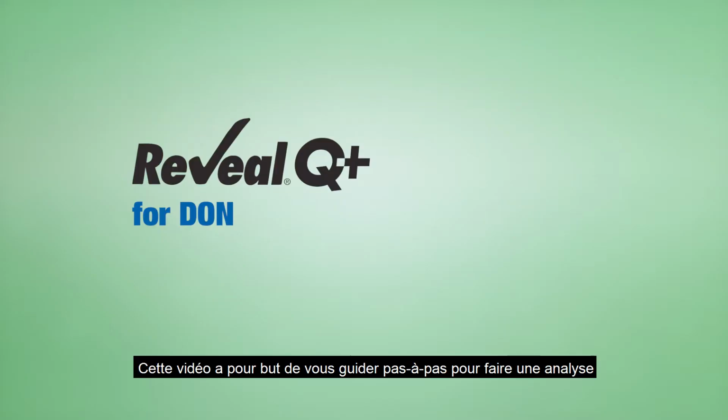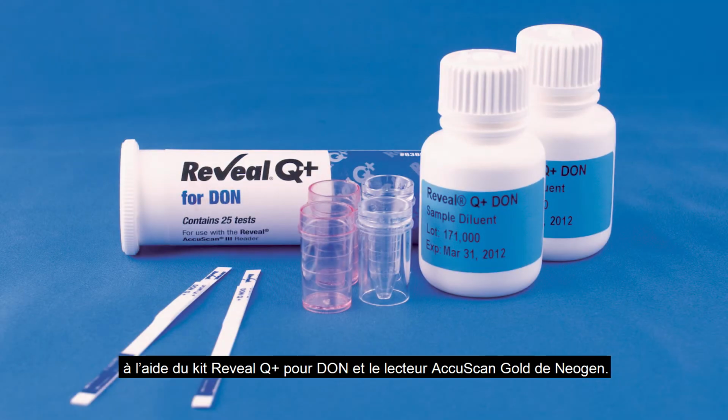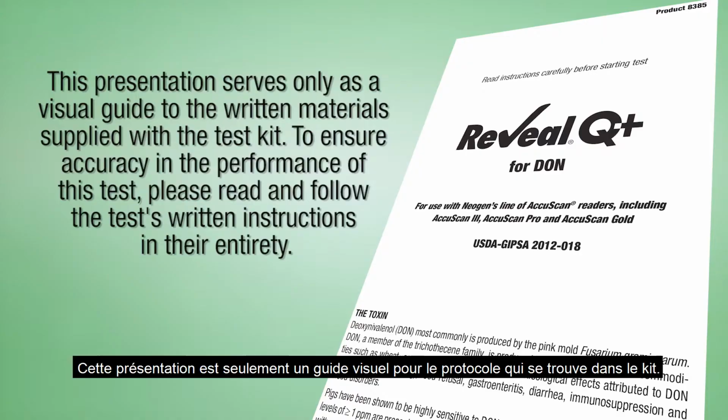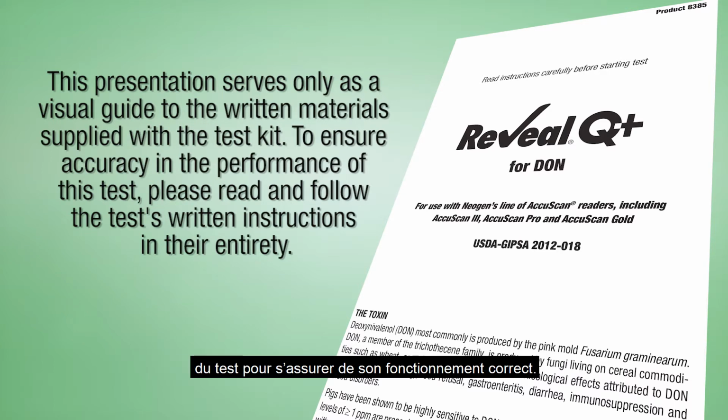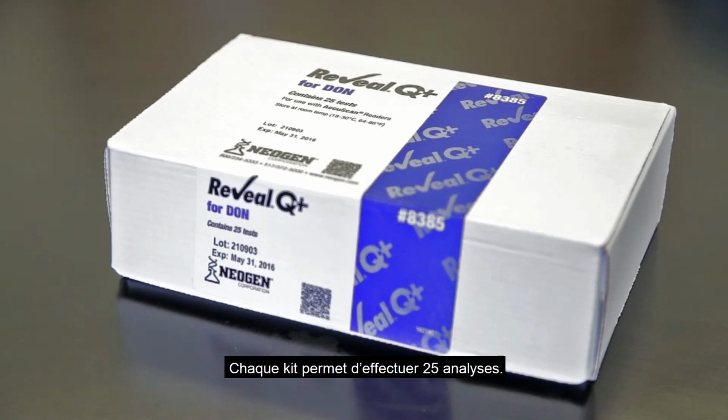This training video guides you through the steps to successfully conduct a test using Neogen's Reveal Q+ for DON and the AccuScan GOLD reader. This presentation serves only as a visual guide to the written materials supplied with the test kit. To ensure accuracy in the performance of this test, please read and follow the test's written instructions in their entirety. Each kit contains enough sets to test 25 samples.